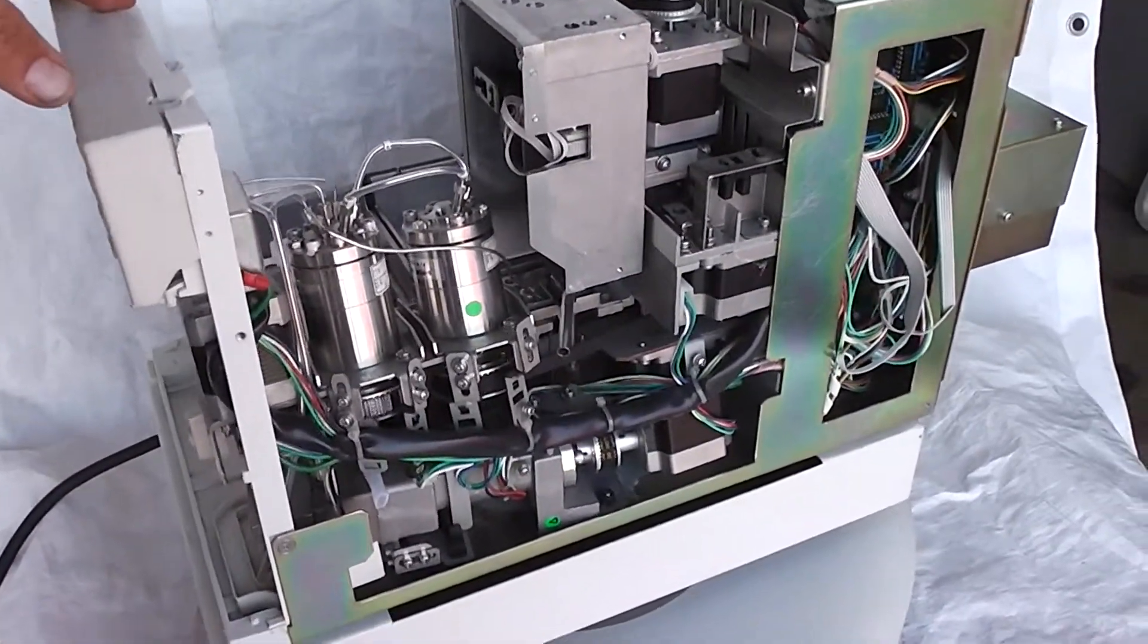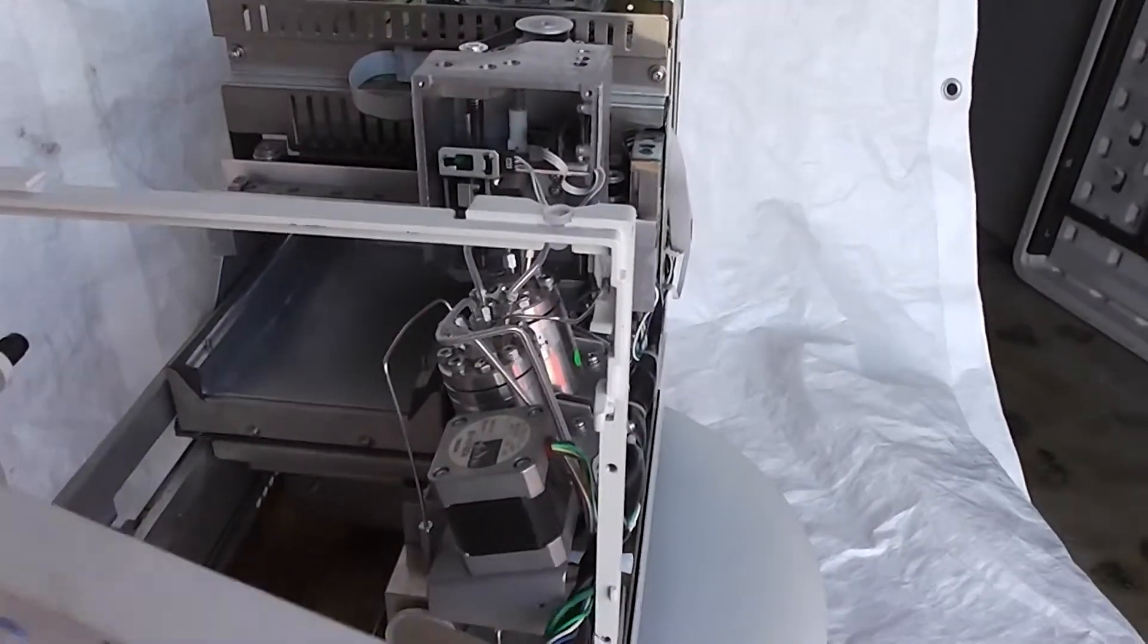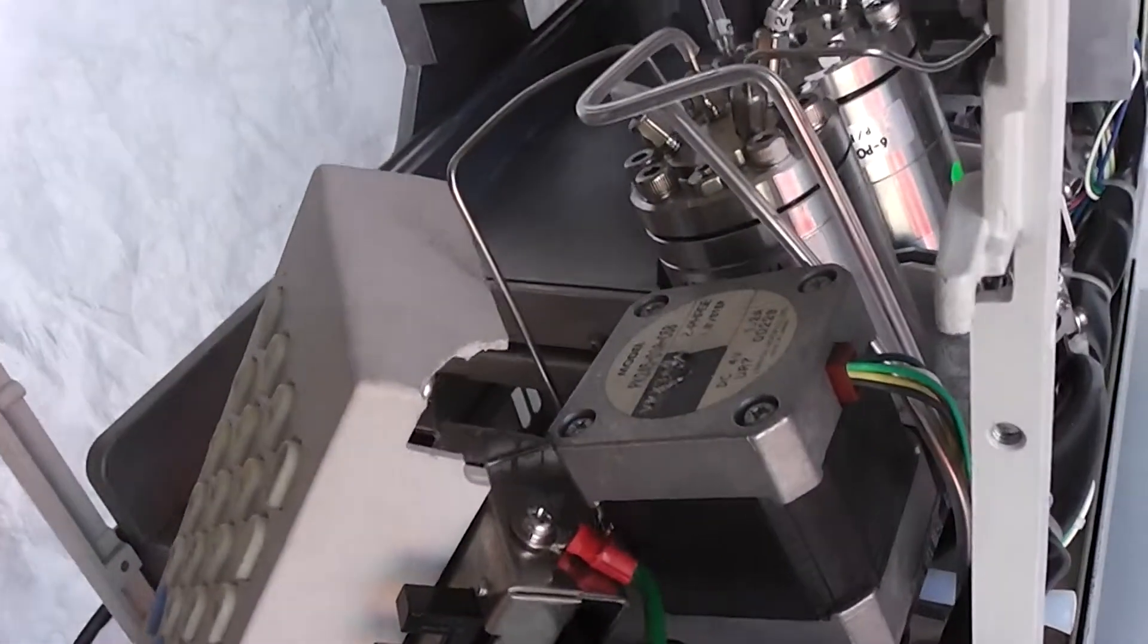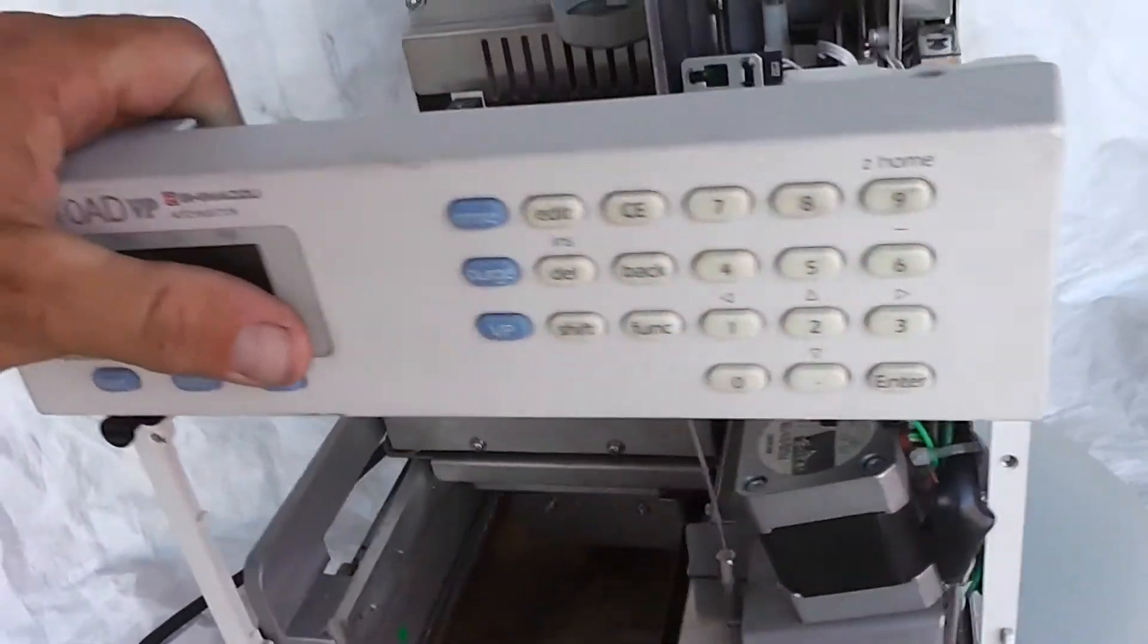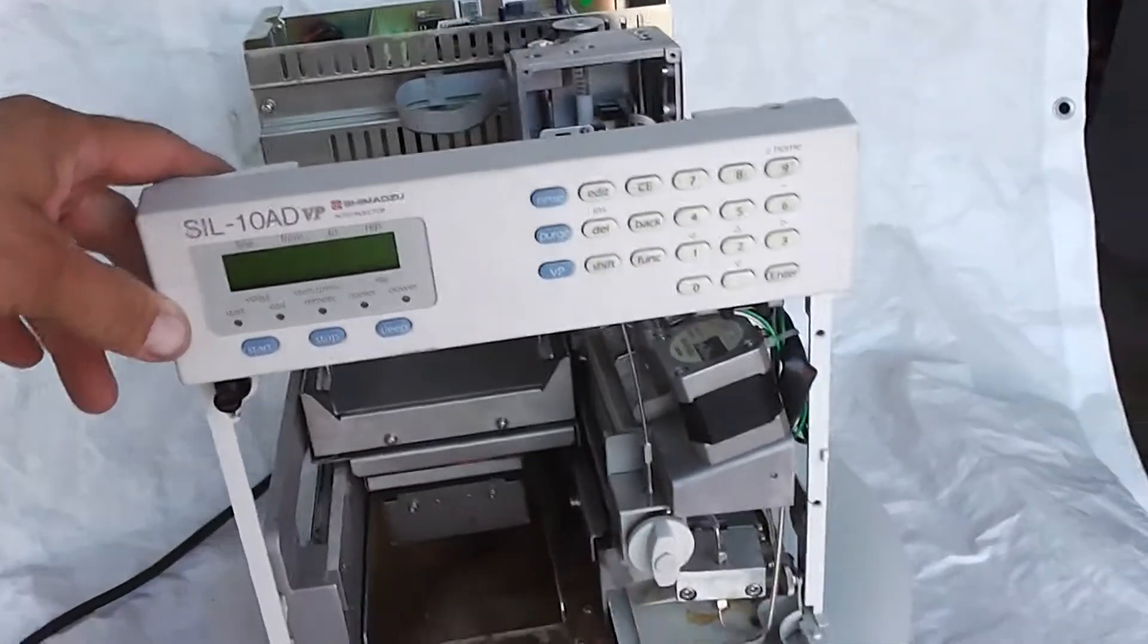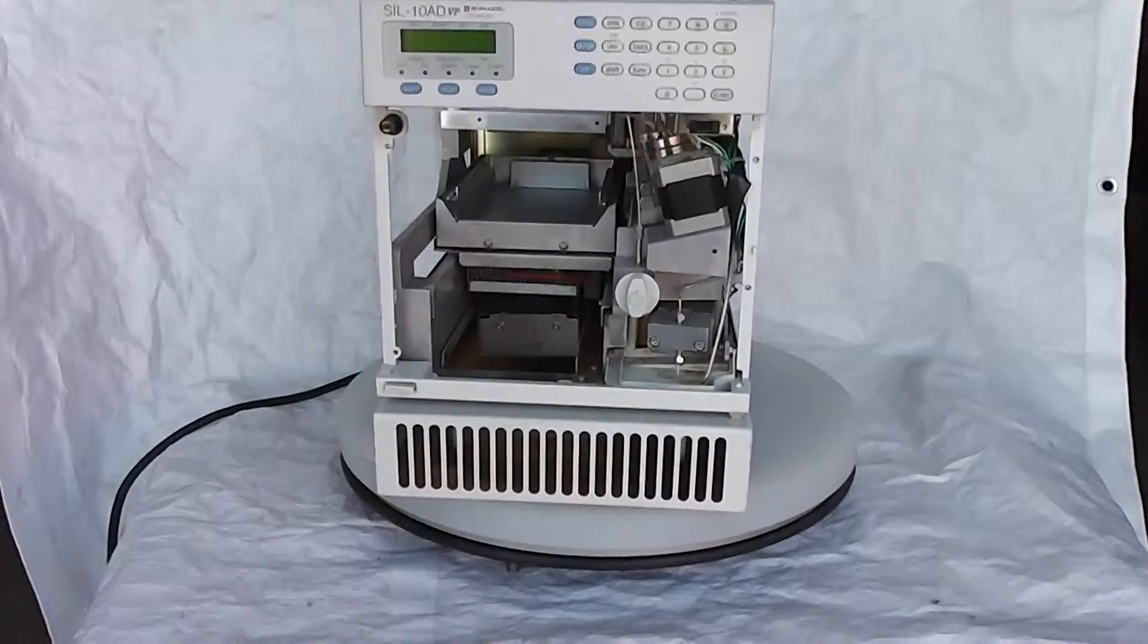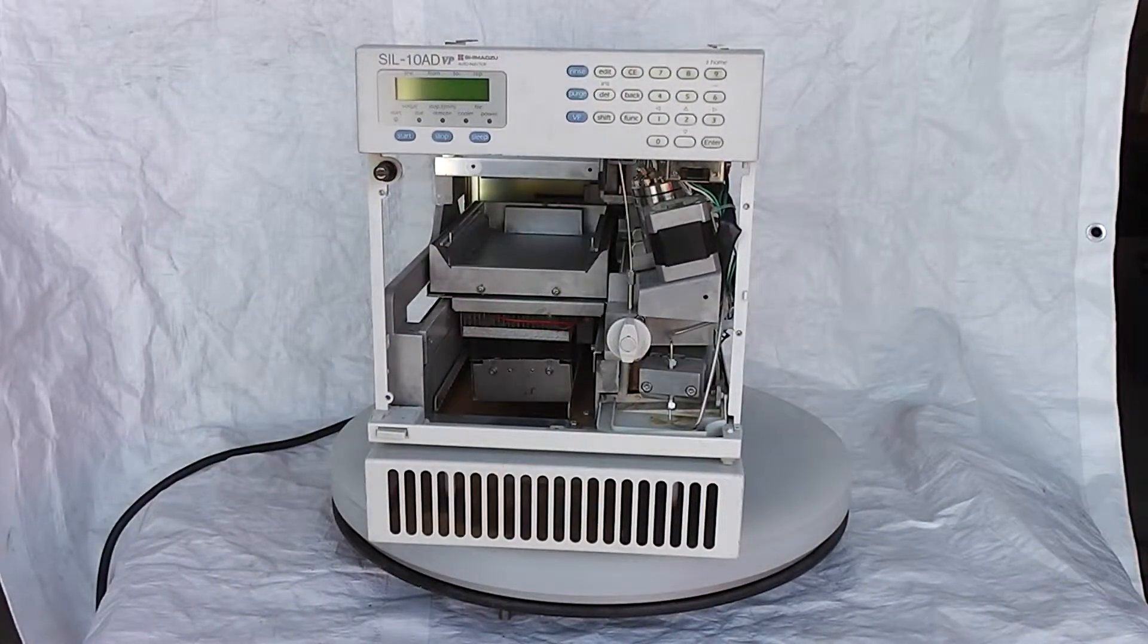We're going to power it up and get an error message, Needle Z Home. This cover pops off. There's actually a little crack right there. We'll have a picture of that in the auction. Put it back on the stand here.